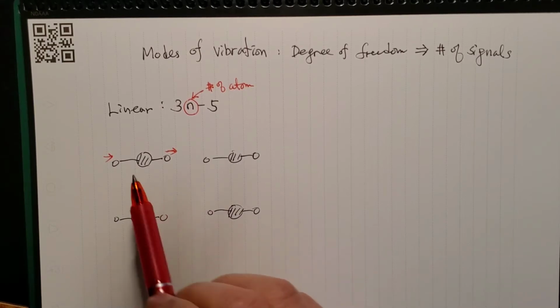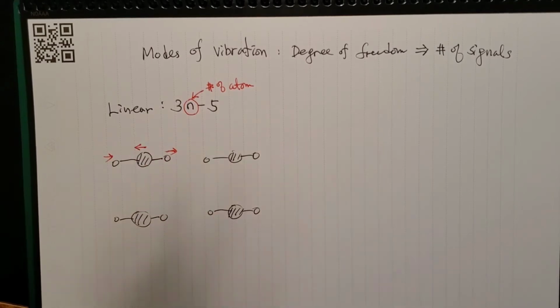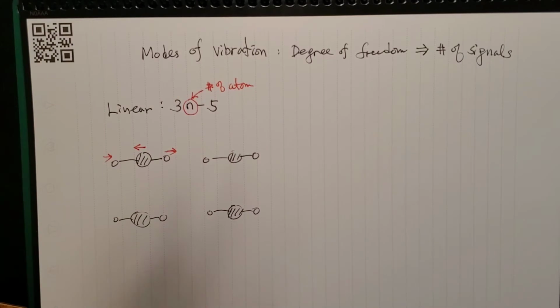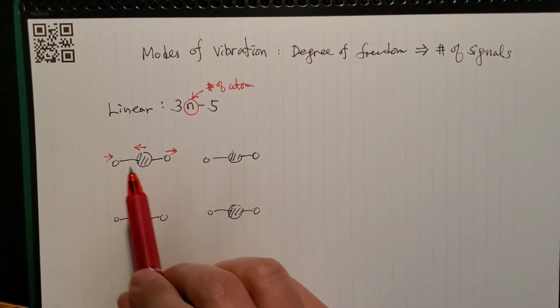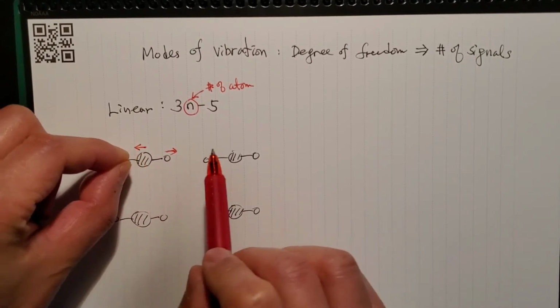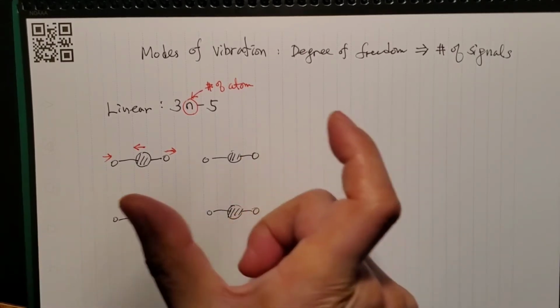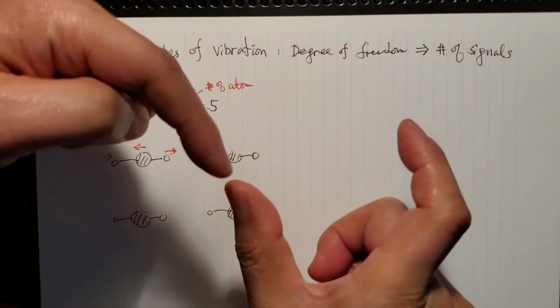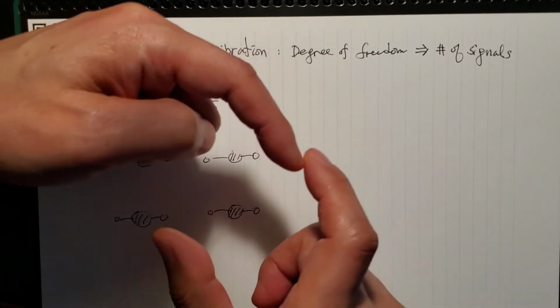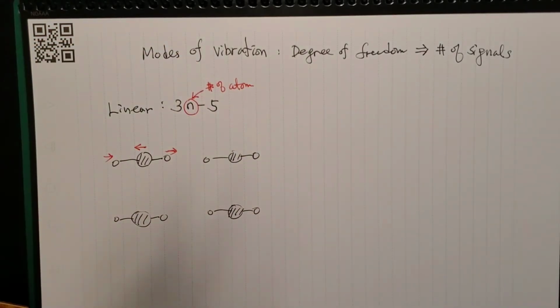So in collaboration, the atom in the center must move this way in order to not move in the coordinate but change the distance between them. They're getting closer while these 2 get apart. So it is actually vibrating that way. You can imagine the 2 and the atom in the middle like this. Oh, not that much, but like this. Yeah, for this mode you have 1.